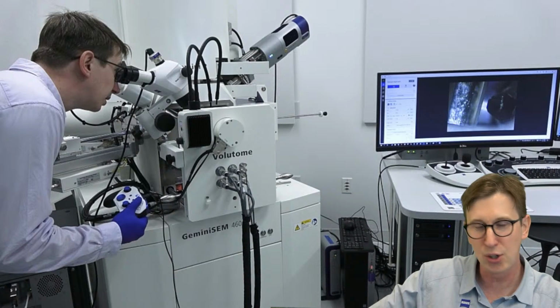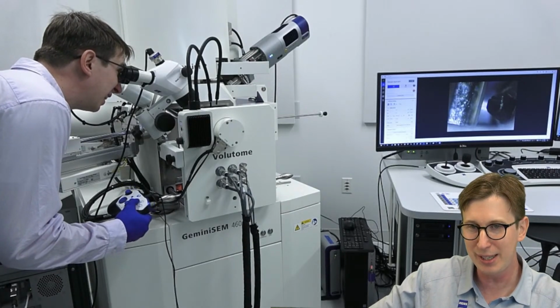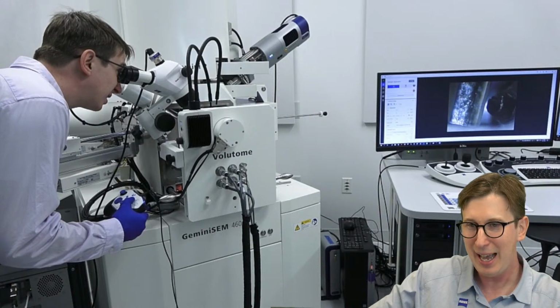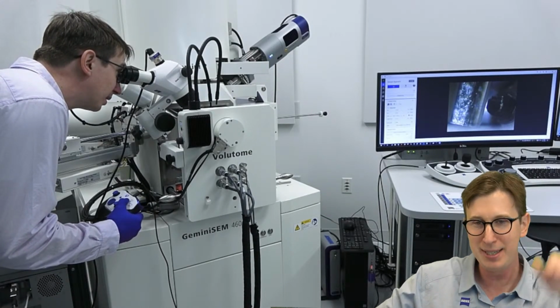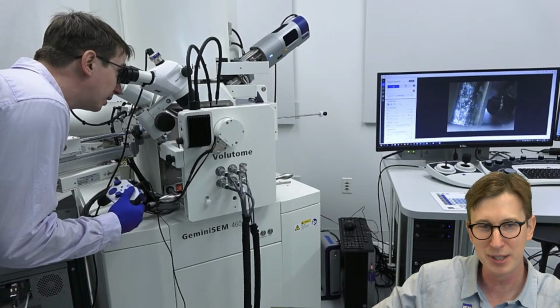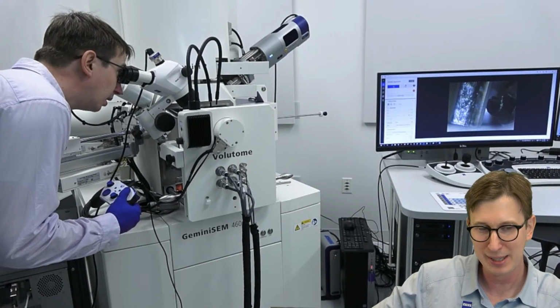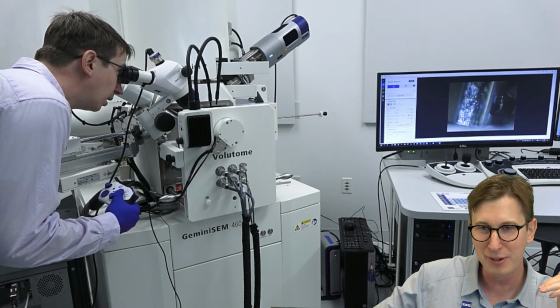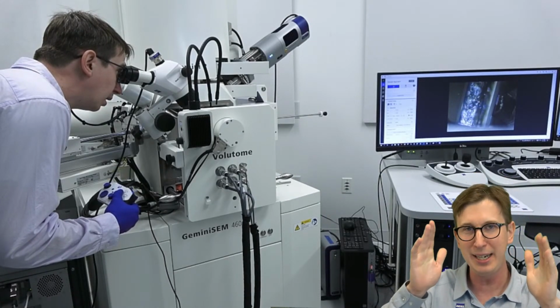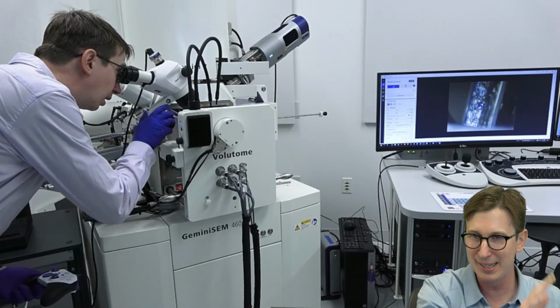Now, what the controller is allowing me to do, so I'll play the video here, take a look at the screen on the right. As I press back and forth, I actually can move the position of the knife over the sample. This is allowing me to get perfect approach of the sample to the knife, and also defining that cutting window of where I want it to start carefully cutting and where I want it to end cutting.